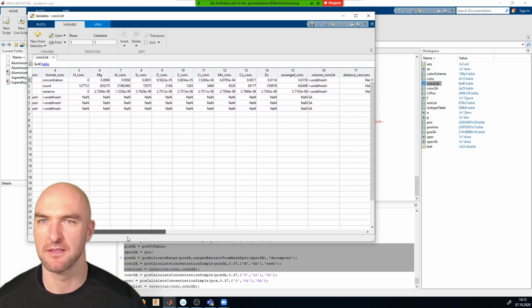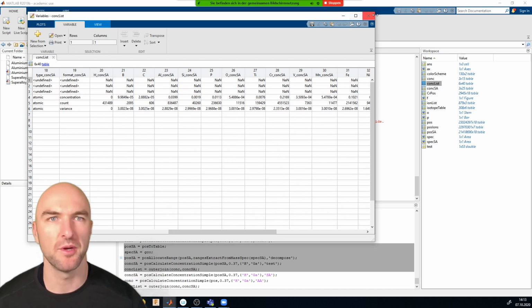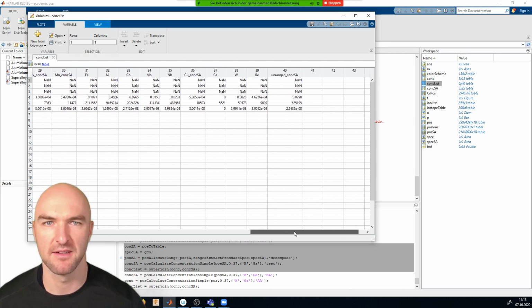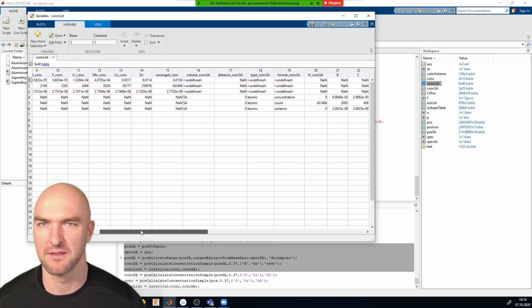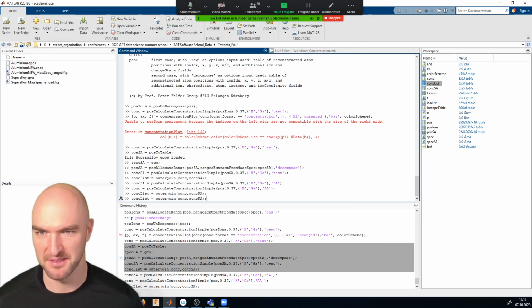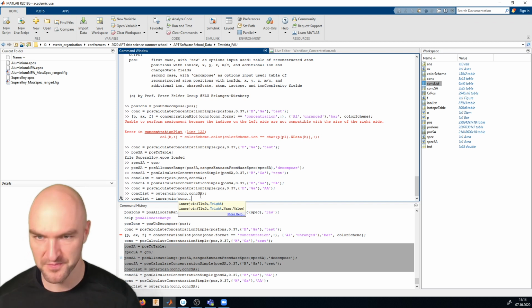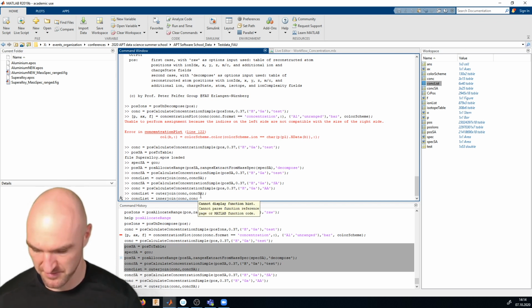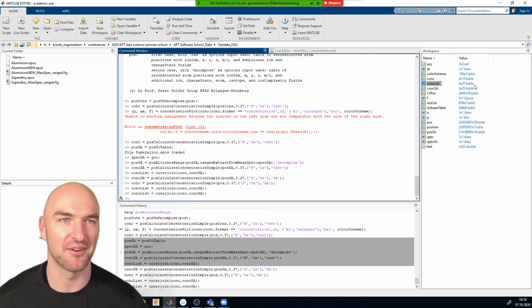Okay, it's a weird way it's arranged, but I think the outer join was the wrong one. Was the inner join. So usually I do that only with two. Okay, now it's 0.